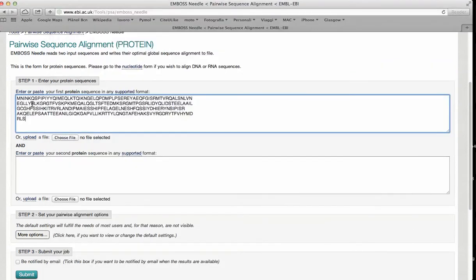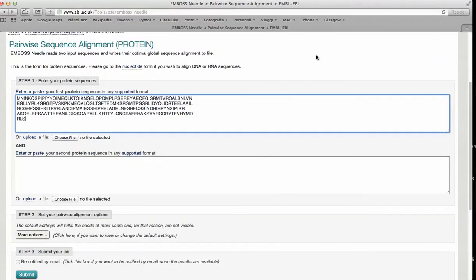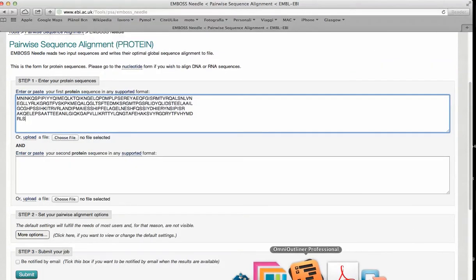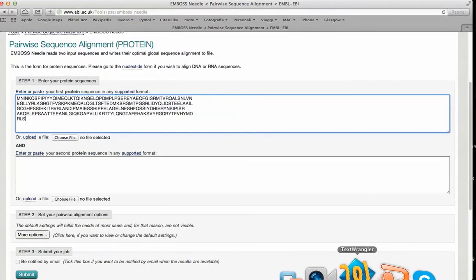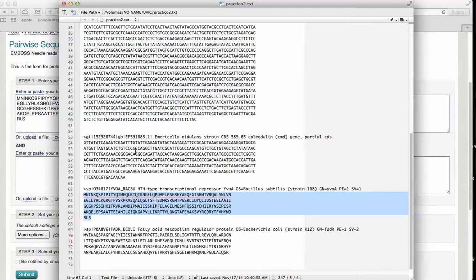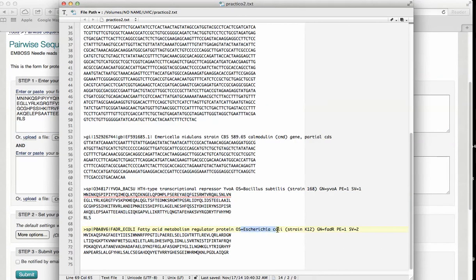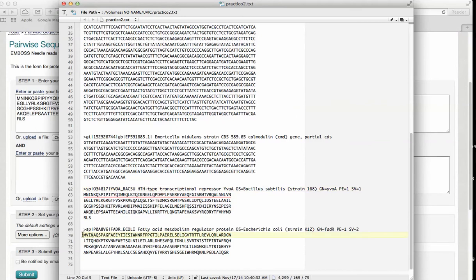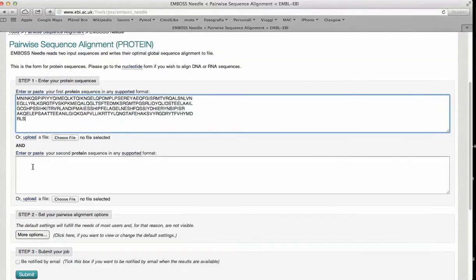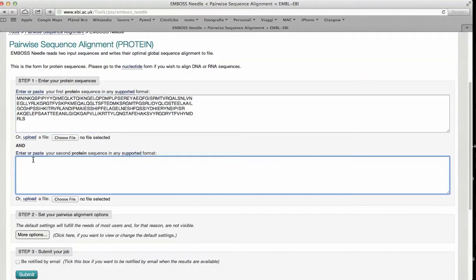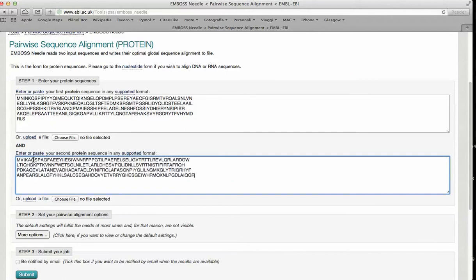Here we have two transcription regulators from E. coli and from Bacillus subtilis that maintain a very distant evolutive relation.